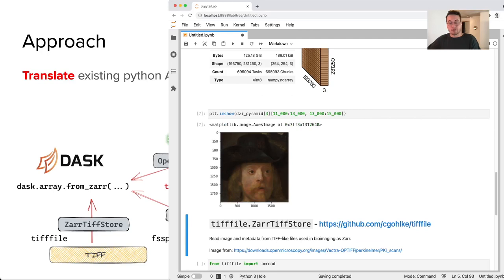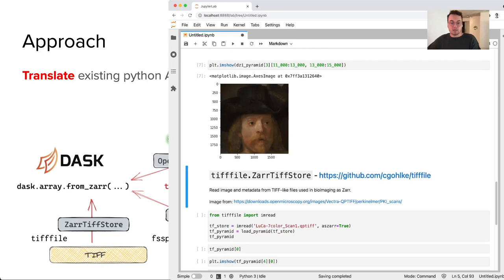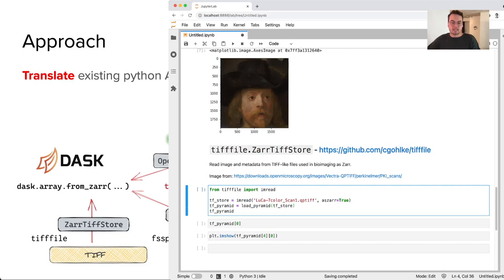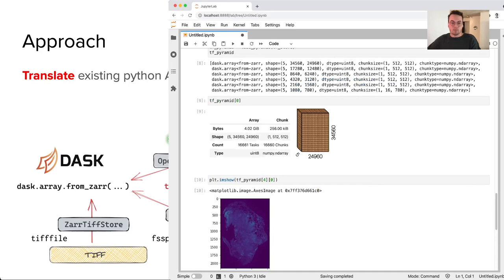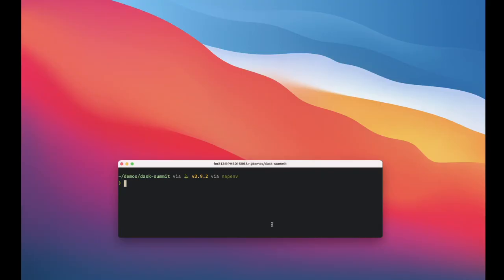And finally, I can use the TIFF file library and its built-in imread function with aszar to read another multi-channel imaging dataset as a multi-scale Dask array. Here I'm reading that image, I can print off the highest resolution, and I can draw one of the channels from that image at a lower resolution.